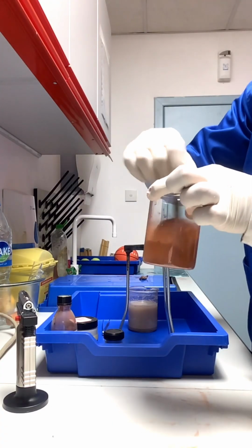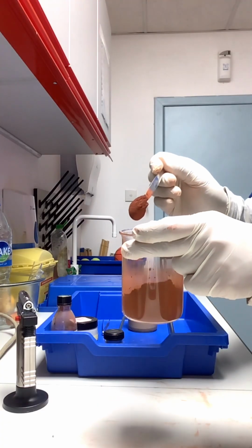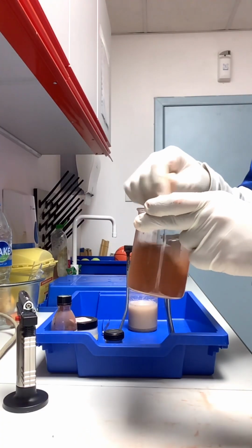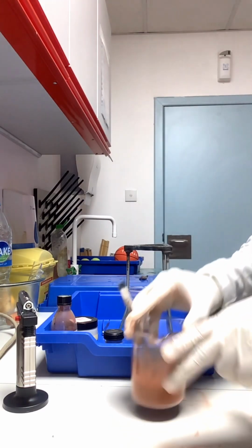However, you won't be able to see the aluminium very easily over here as it has completely mixed up with the iron oxide. However, you will definitely see its reaction taking place once we start.